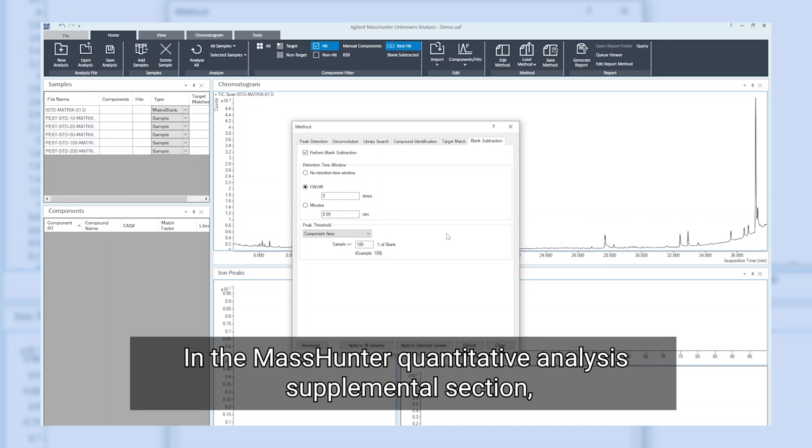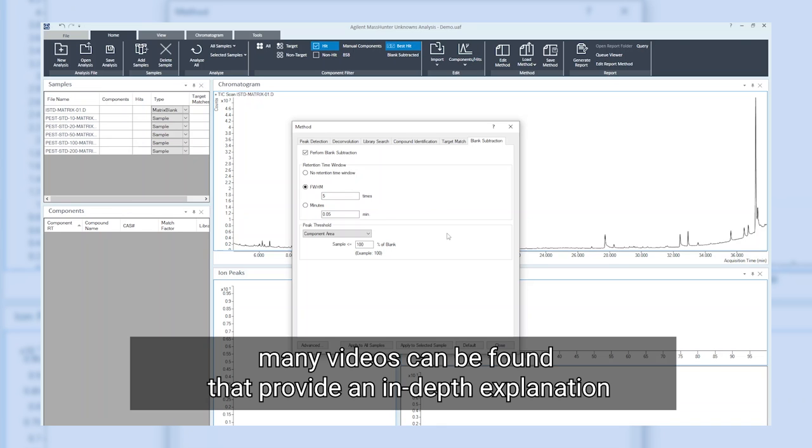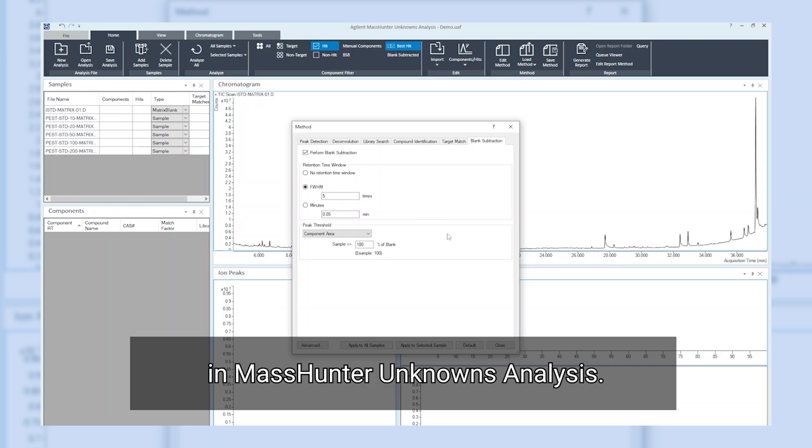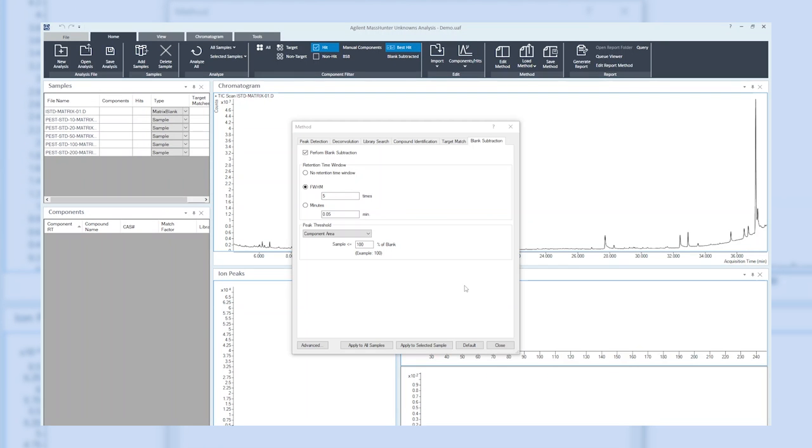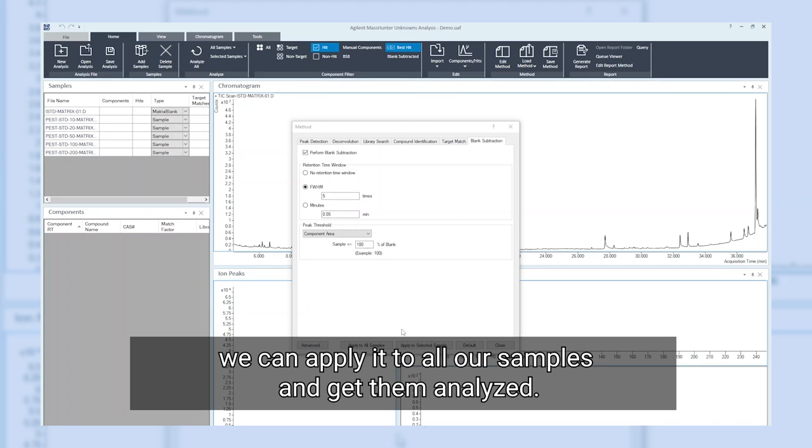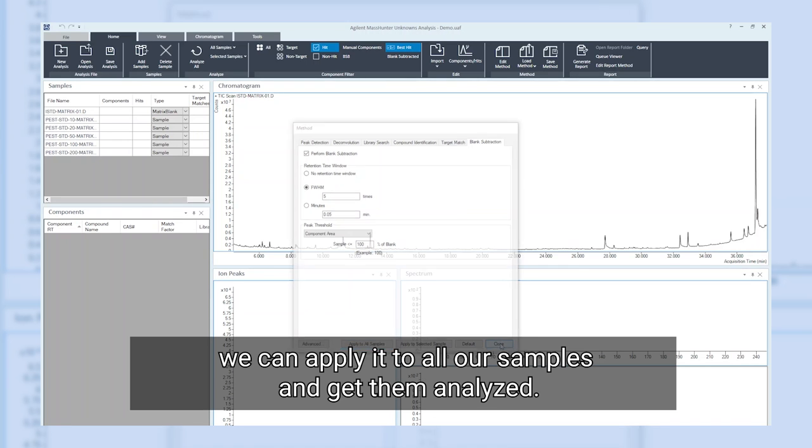In the MassHunter quantitative analysis supplemental section, many videos can be found that provide an in-depth explanation of the individual parameters for the method setup in MassHunter unknowns analysis. Once we are finished with the setup of our method, we can apply it to all our samples and get them analyzed.